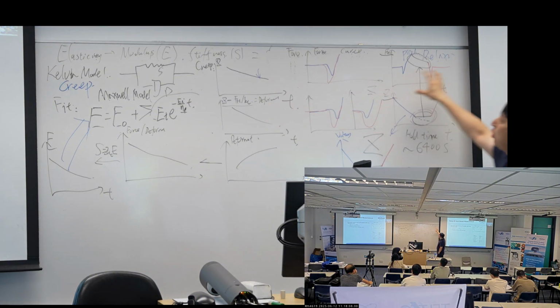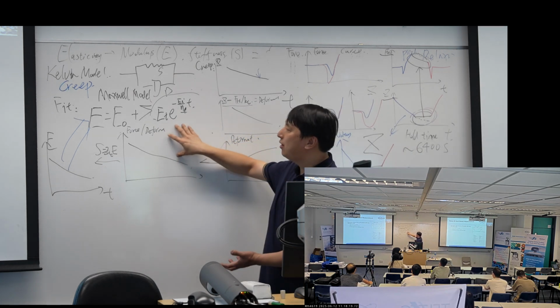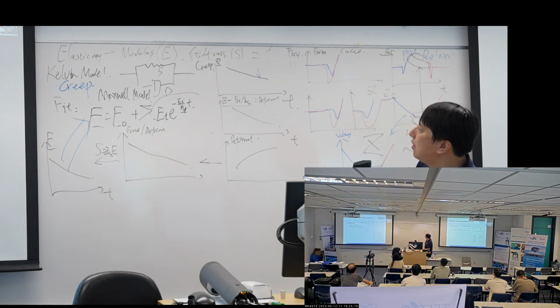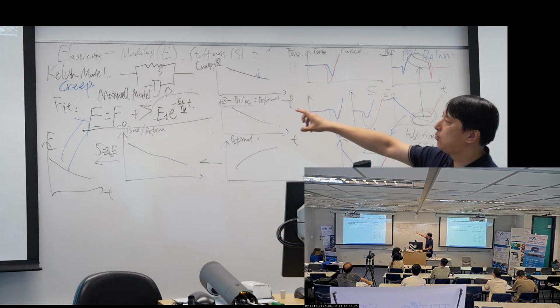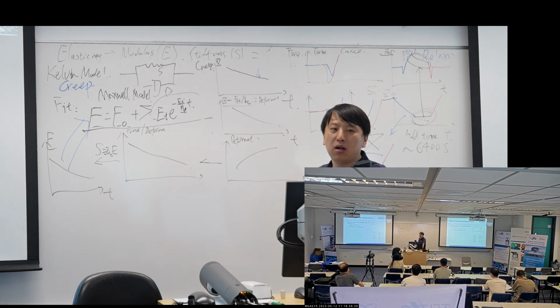And if you want to do the relaxation, it's the same thing. But for the relaxation, as Dr. Ma said, the deformation is changing. The force is also changing. When we divide them, it's two changing numbers. So that's about the data processing. The final result is to find the fitting equation of this ramp and hold or the creep experiment.